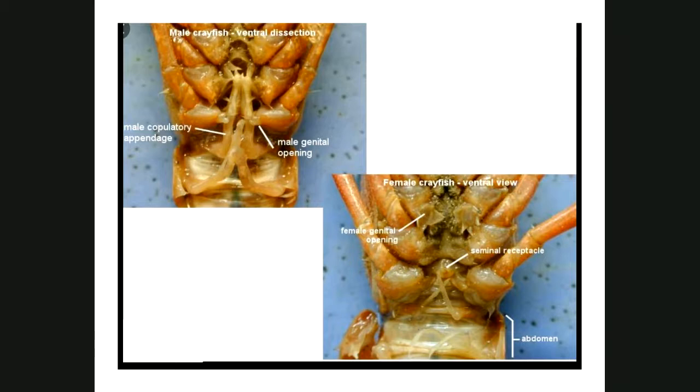All right, here we have a male crayfish. And this is the male copulatory organ. It almost looks like a little leg. It's strong and rigid, and it's like these other structures that line the tail, which are the swimmerets, right? Because the tail continues down. They have little swimmerets that keep going, little appendages that help them swim around.